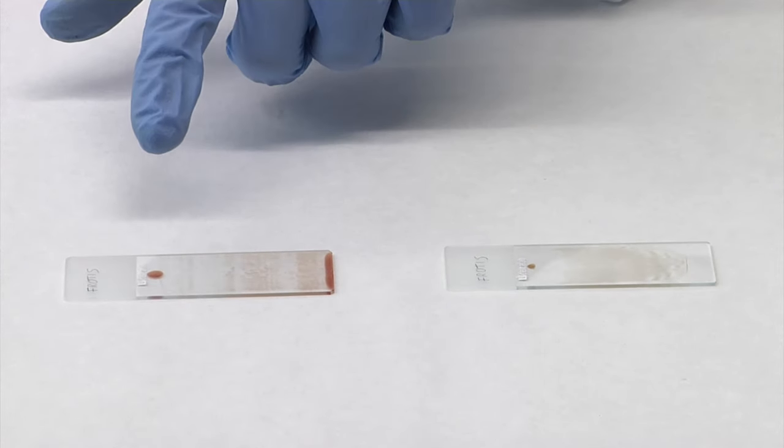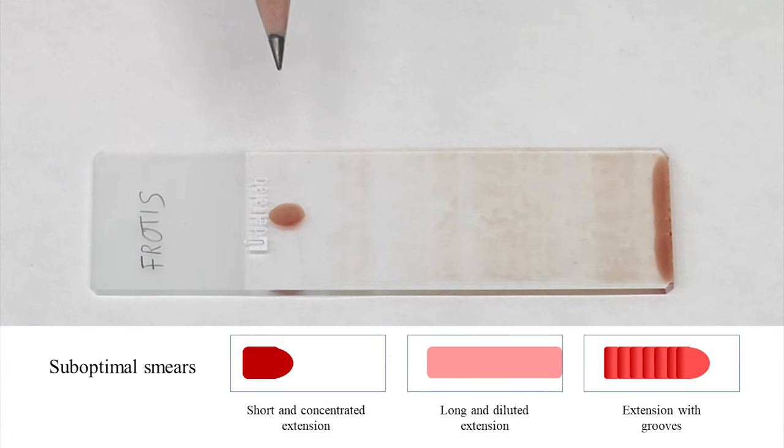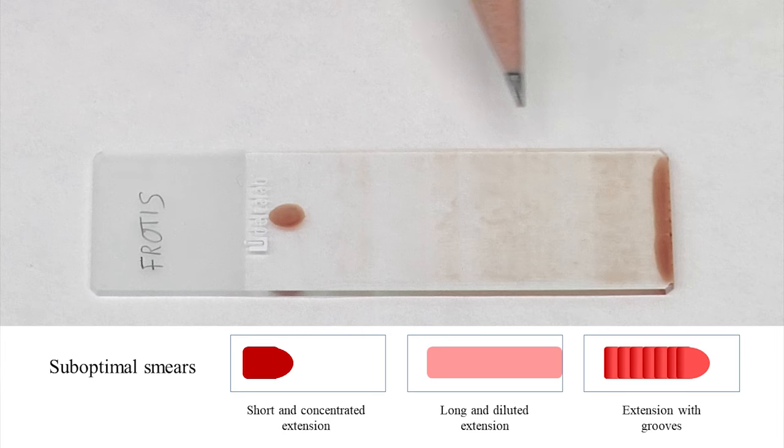Here, we show you a smear that is not optimal for its staining with Giemsa. We can observe several defects. An excessively large drop of blood was deposited. Grooves that appear because the slide did not slip with even velocity and pressure. There are areas with an excessive accumulation of erythrocytes and areas where they are deformed. There is an accumulation of blood at the end, due to the excessive size of the drop deposited.